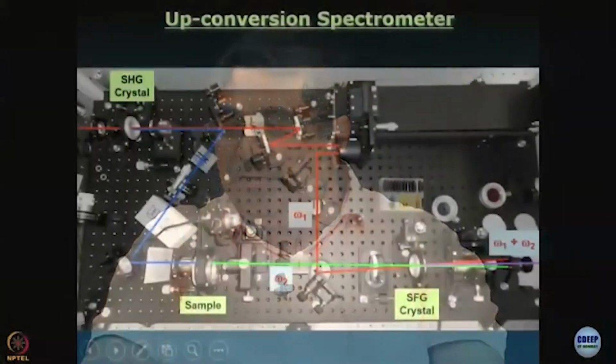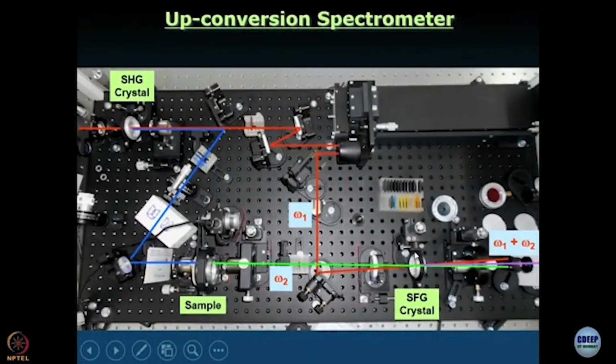But what does all this have to do with femtosecond time resolution? So, femtosecond optical gating, we have understood the optical gating part perhaps, because we said that this omega 1 light is called optical gate, but why is it called a gate? And we have understood the femtosecond upconversion because here we are doing upconversion. So, this crystal is also called the upconversion crystal, okay. But how does that give us femtosecond time resolution? That is what we are going to discuss in the next module.